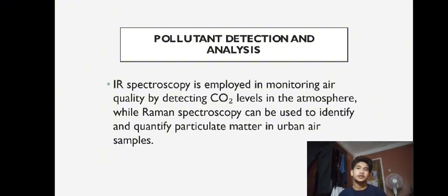Another application is for pollutant detection and analysis. Infrared spectrometry is employed in monitoring air quality by detecting carbon dioxide levels in the atmosphere, while Raman spectrometry can be used to identify and quantify particulate matter in urban air samples.